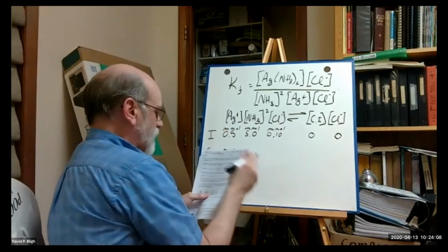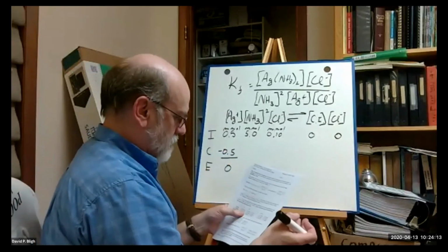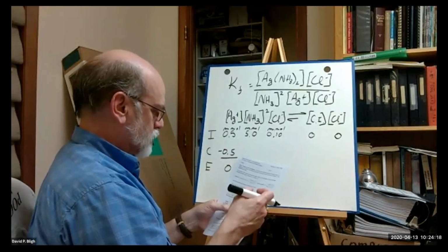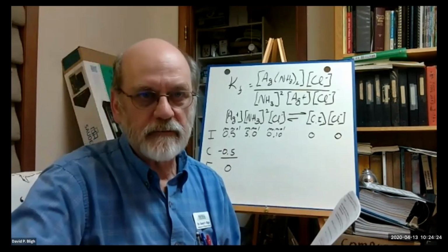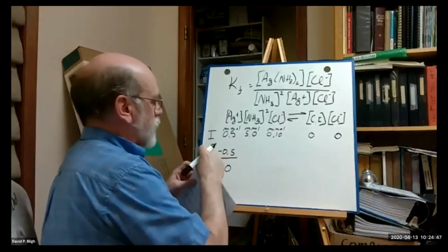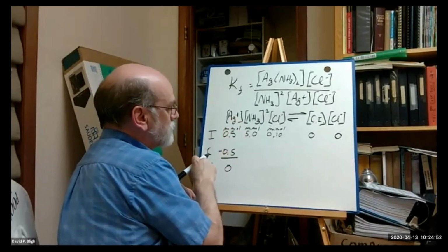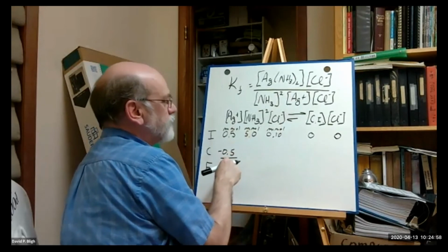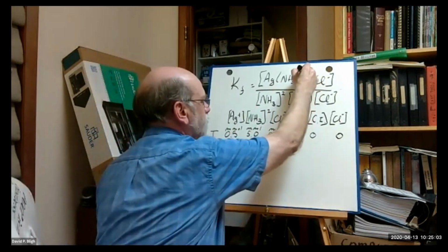Ammonia, in order to do this, we had to use, let's see, pause for a second. Okay, so look at the ratio. If we use up the silver to form this ion, let's see, that needs to be a plus there.